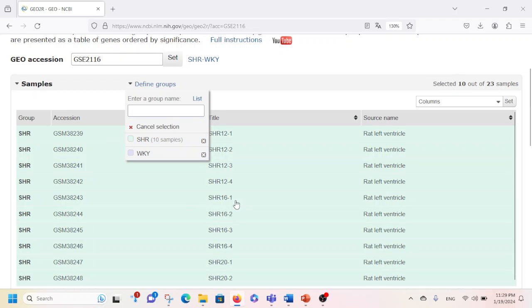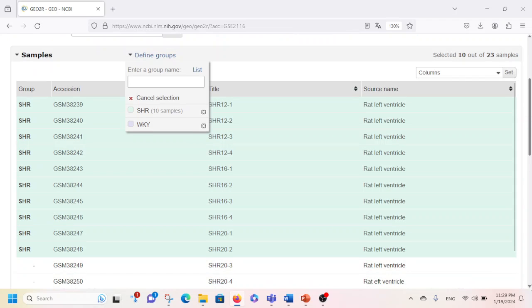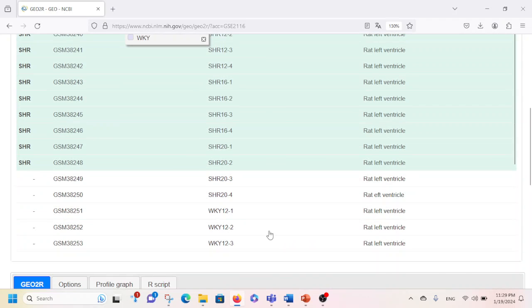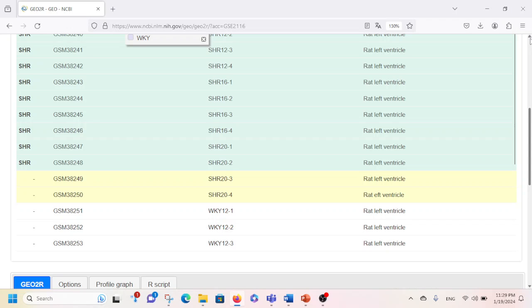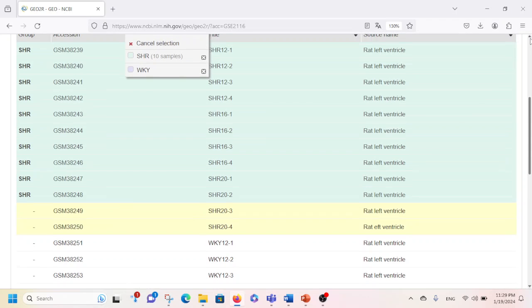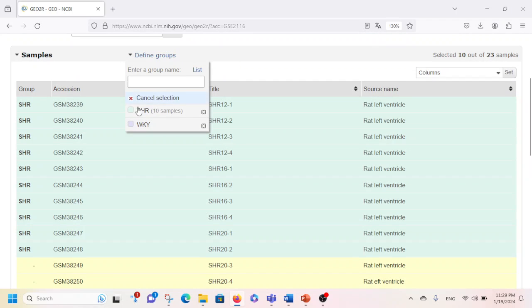These samples will be incorporated into this particular group. I'm going to scroll down further and I will also include these two additional SHR samples into the SHR group.